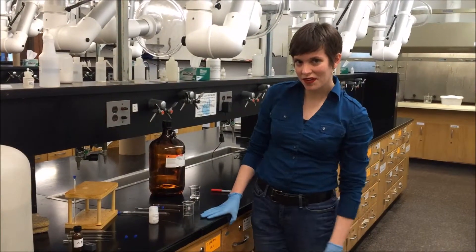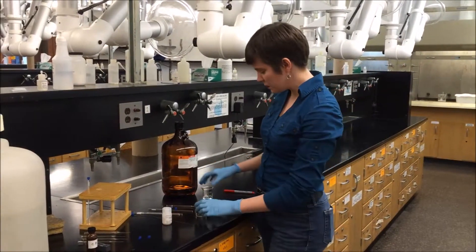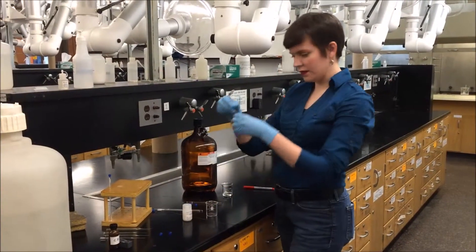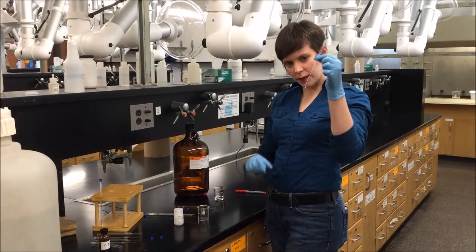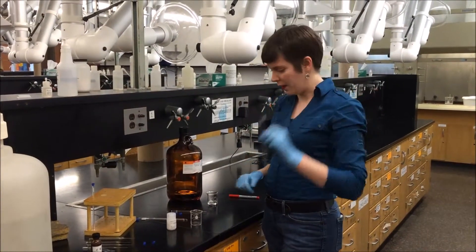Hi, I'm Tori Stunmark at Shoreline Community College, and I'm going to review how to fill an NMR tube. You're going to need to put some sample in it, dissolved in a suitable deuterated solvent, and put a cap on it.